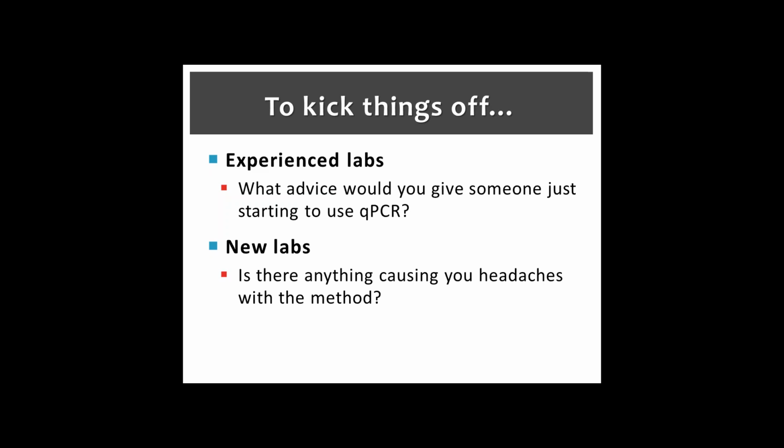Any other questions or comments? We do have one. So for those on this side of the room and online, the question was what type of data file should you be sending to Holly? And the response was not an Excel file. It's a .eds file that is generated by the StepOnePlus.